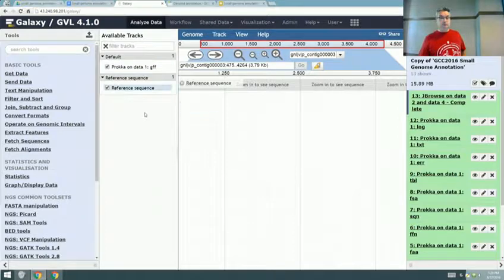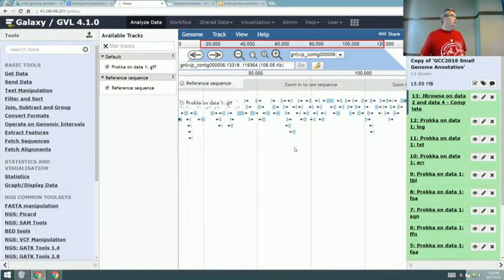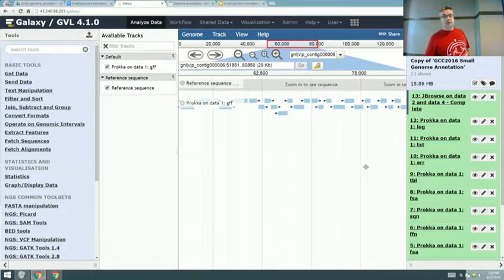Well, Eric's right there. But my understanding is JBrowse is about to get released, like massively rewritten. Is that true? That's what the... JBrowse is about to be rewritten massively. So anyway, we're adding a number of features.